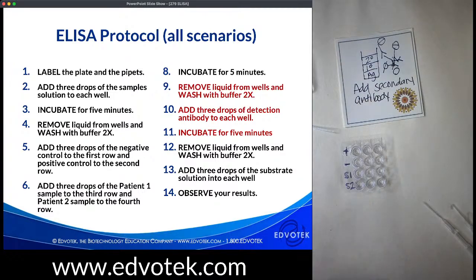Okay, so while this is going, we do use the ELISA in 195. So if you look at the description, thank you, Maria. I never remember the specifics of every experiment, but you'll use the ELISA to analyze simulated crime scene samples for the presence of drugs. And so that'll be a great lab for you to review, to think about the ways that we can use ELISA for drug detection.